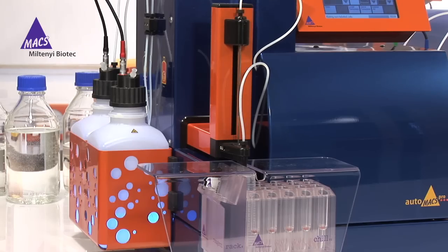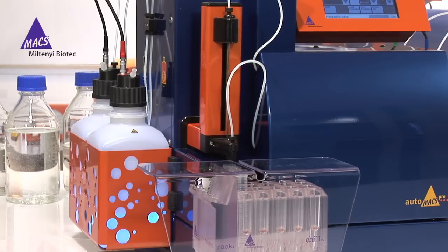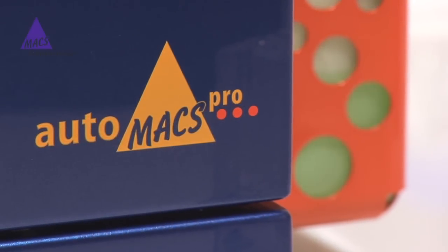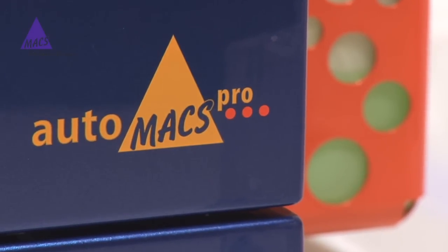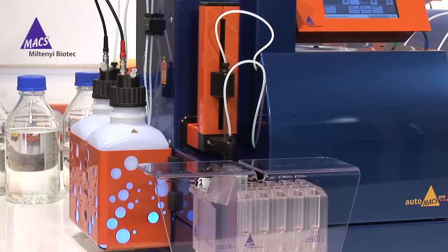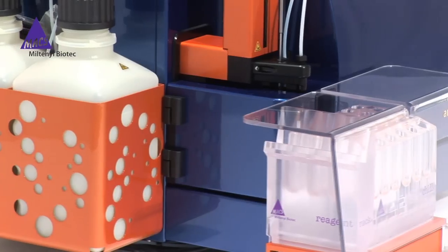The procedure is very fast, efficient, and reliable, without a need for erythrocyte lysis or density centrifugation. It is also suitable for labs with routine analysis of multiple samples.